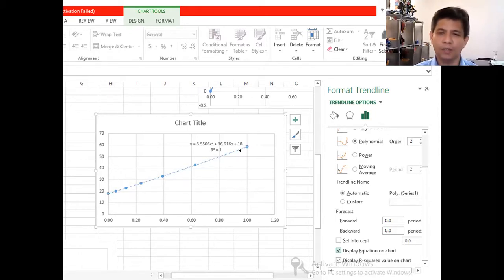So kung natatandaan nyo, yung solve natin problem, pag kinuha mo ang derivative nito, this will give you the derivative of ethanol. Ethanol yung kukunin nyo. Siyempre, water palagi yung solvent. So, this will give you the partial molar volume of ethanol pag kinuha nyo yung first derivative nito. Ganun lang yung gagawin natin sa experiment. At this point, ang bago lang naman kasi dito sa experiment na 'to, yung pycnometer.